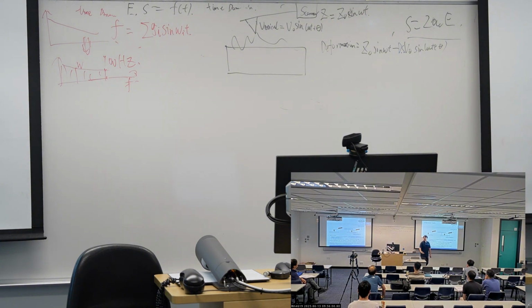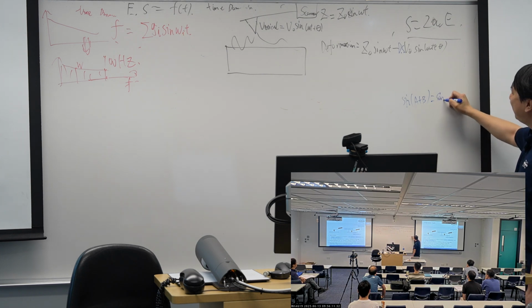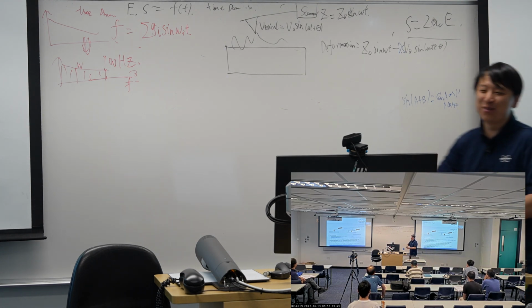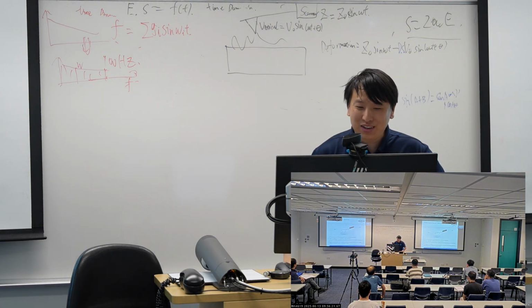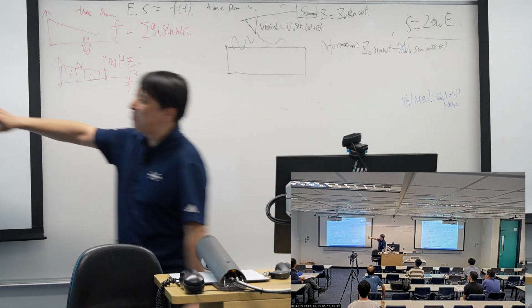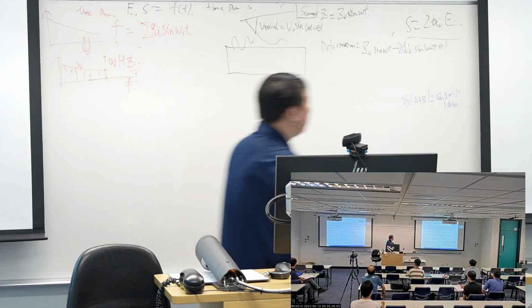You still remember the mathematical games about sine: sine(A plus B) equals sine A cosine B plus cosine A sine B, right? We can play the game, but I hate it. We don't want to do the games, so Bruker did the game for you, and it makes quite a long equation. You don't need to remember it.